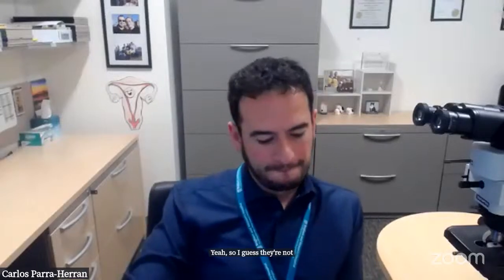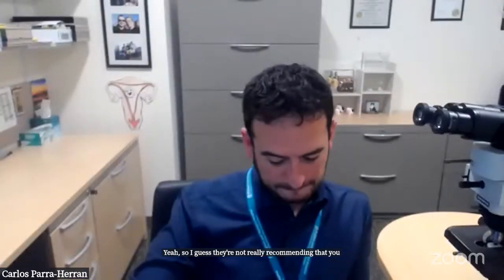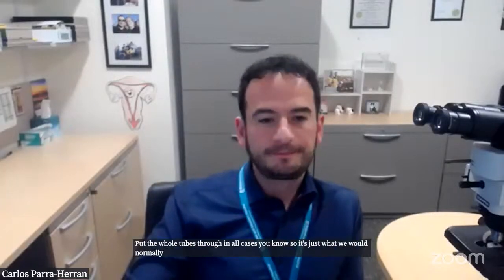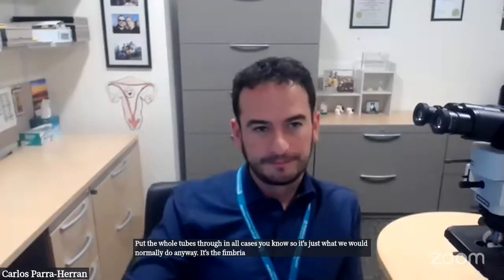Yeah, so I guess they're not really recommending that you put the whole tubes through in all cases, so it's just what we would normally do anyway. It's the fimbria and representative tube.